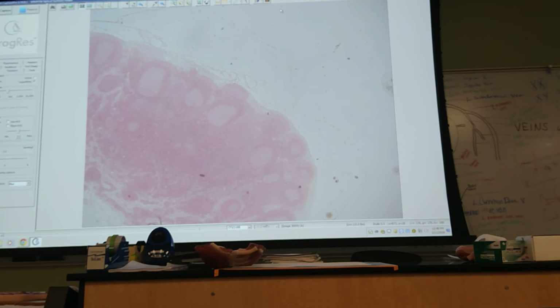And so they use lymphatic vessels to go in and come out of lymph nodes. You get a whole bunch of lymph nodes all over the place. You have certain concentrations in certain areas. We'll show you that. But basically, the lymph vessels are found in the pericapsular tissue. The ones that are going to bring in and then take out.